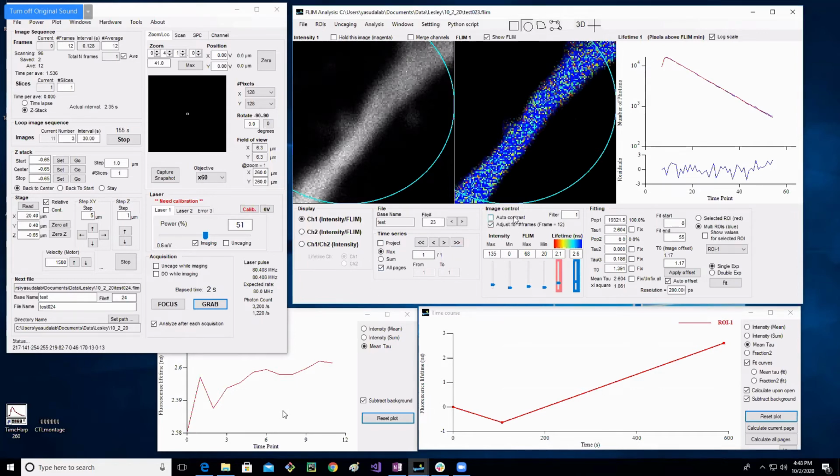All right, we do need to talk for a minute about contrast, because there are some values that will affect your actual data. There's really only one value that will affect your data analysis, and that is, if you're analyzing lifetime values, this lower value, the minimum value.